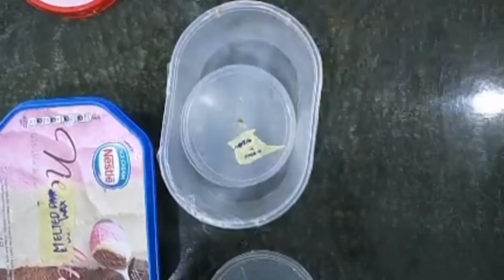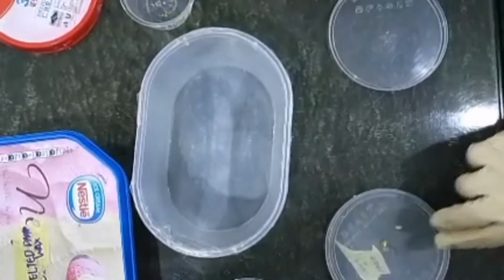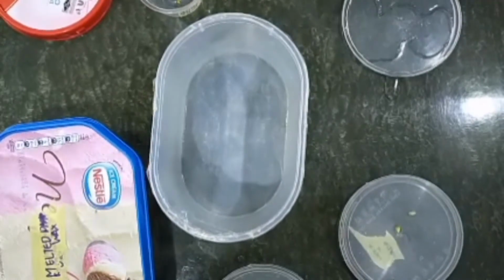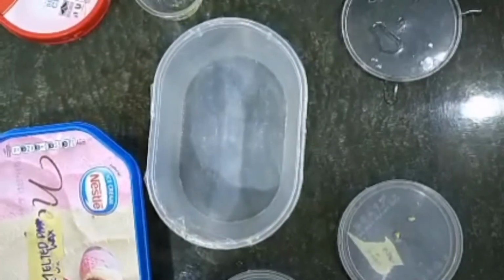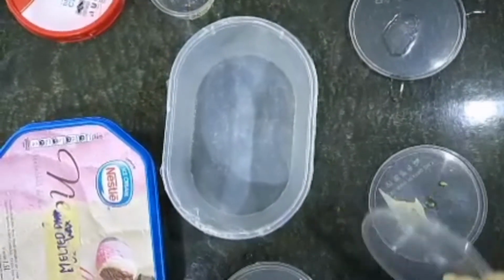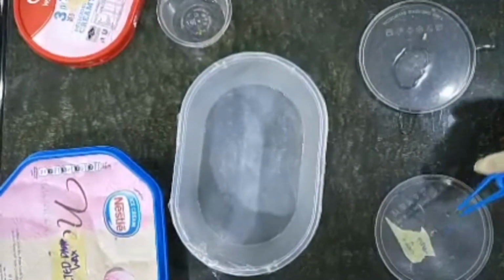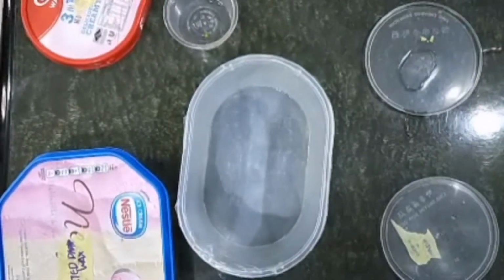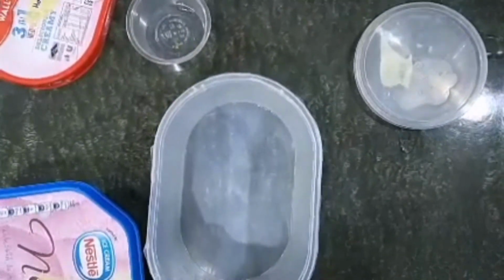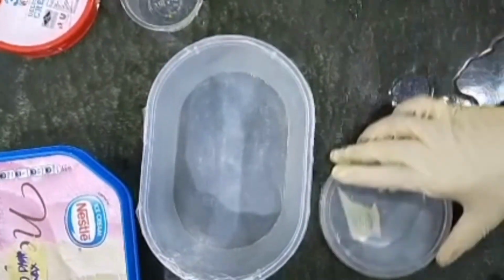The specimen is placed on the cold section of the embedding machine to let the wax cool down, and then we repeat this on the remaining specimens. So we dispense the paraffin wax into the mold, place the specimen in the wax with the area of interest facing down, use a label cassette and place it on the mold with a gentle press, top up with some paraffin, and then also place it in the cold section of the embedding machine to let the wax cool down.